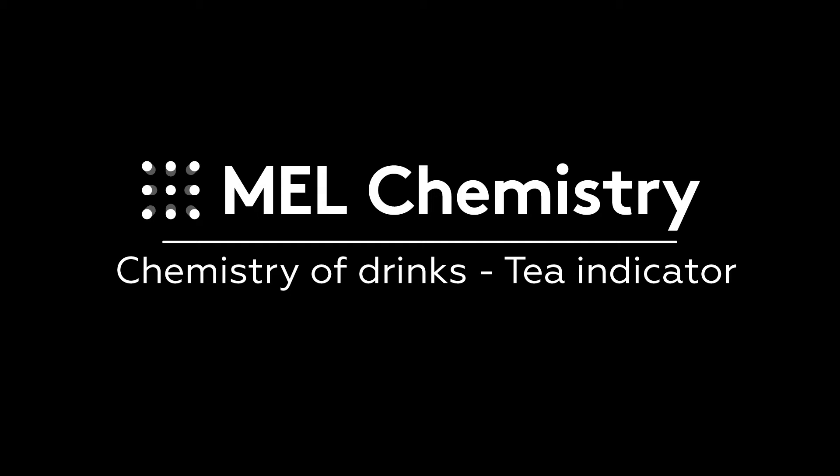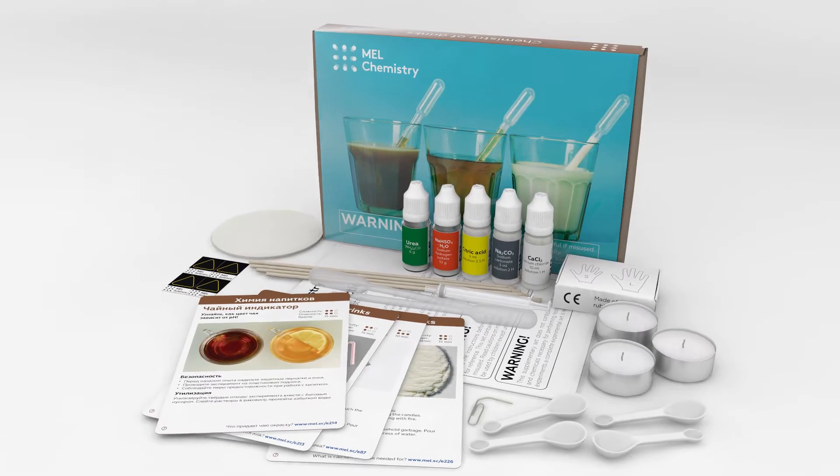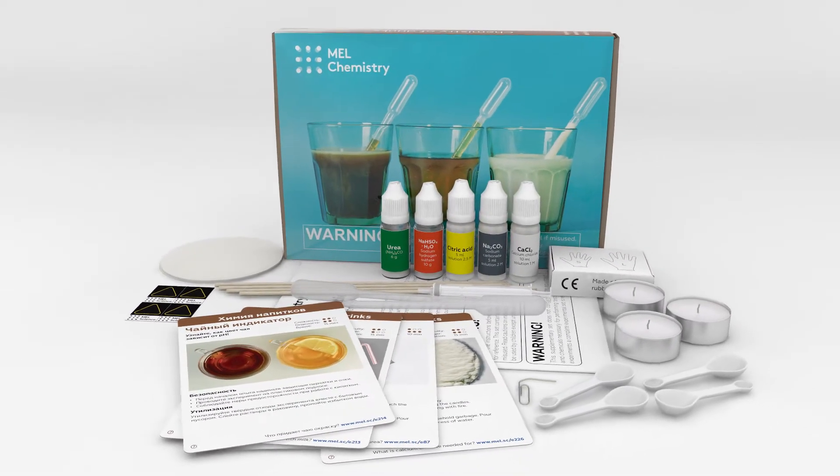Welcome to the wonderful world of chemistry. Today, with the help of the Chemistry of Drinks set by MELchemistry, we will learn how to use tea as a pH indicator.